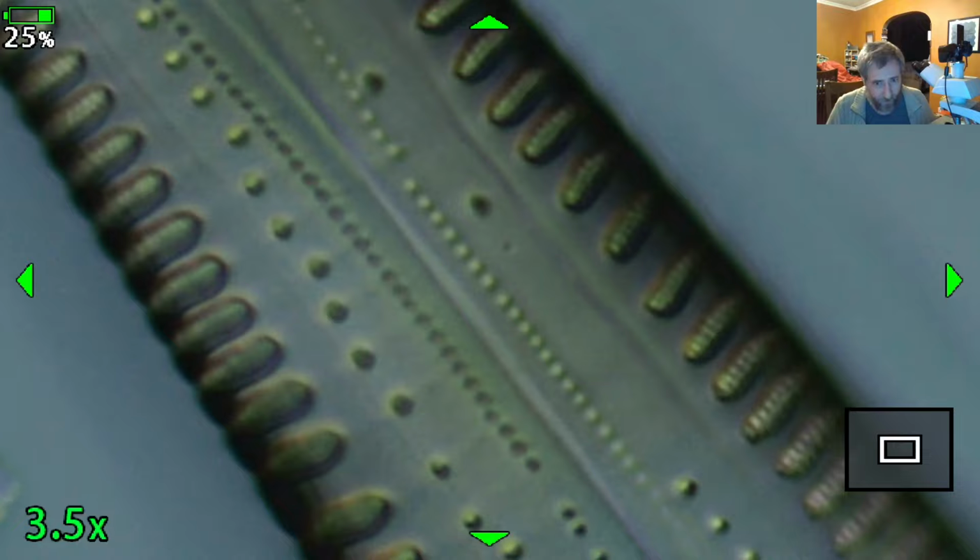You can see the two valves of the diatom. And I don't think this one has a name, which is part of the reason why I was looking for it. I think it's a new species, and I think I found it on Twitch. And I think I found another new species also while I was streaming on Twitch on Saturday. So I actually think I found two new diatom species the other day. I'm pretty sure this is a new species.